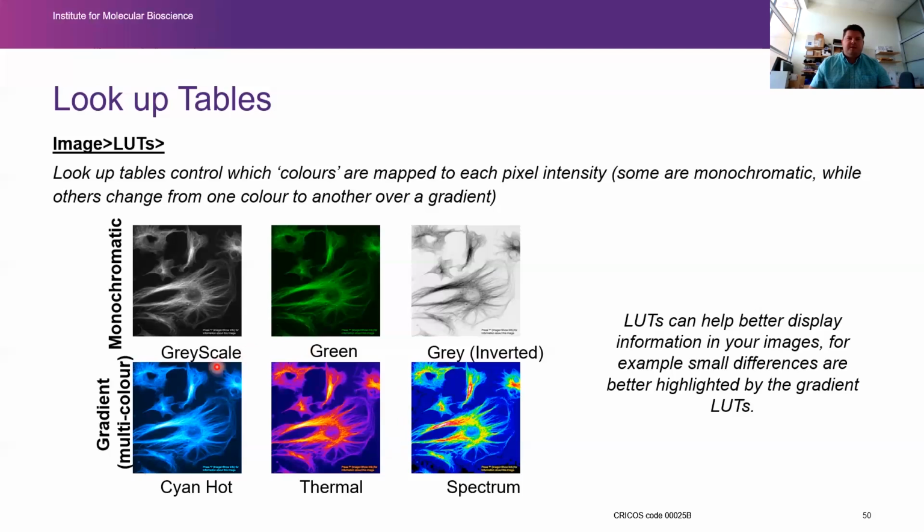Now, usually these types of lookup tables are presented with FRET images, because in FRET or FLIM and things like that, your whole image might only have a range of 0 to 3, and you want to show the subtle differences across that range, so you would use these lookup tables. You can't use these as a multi-channel image. You also can't display your green actin on top of this image. It doesn't really work like that. But they can be used to better display your images.